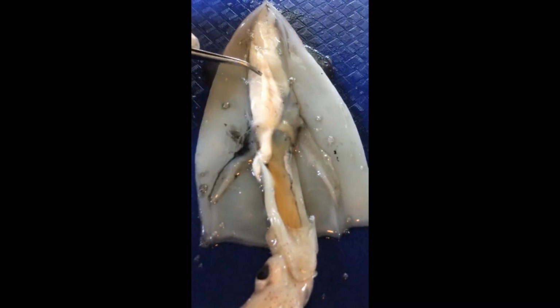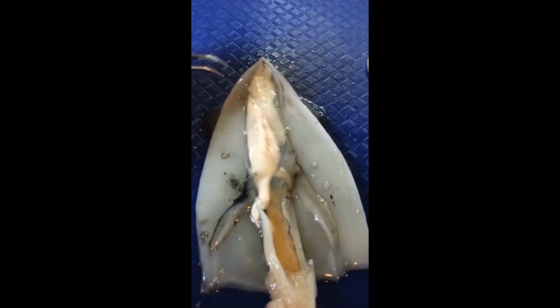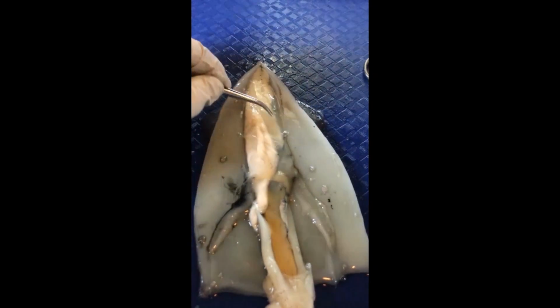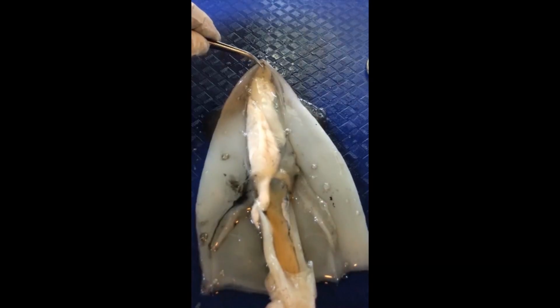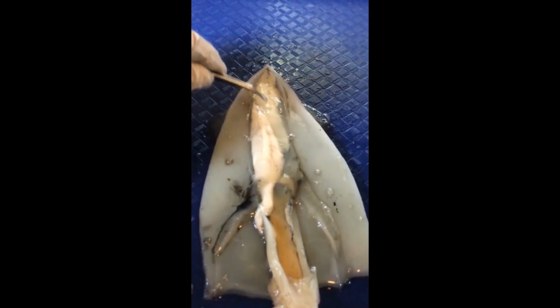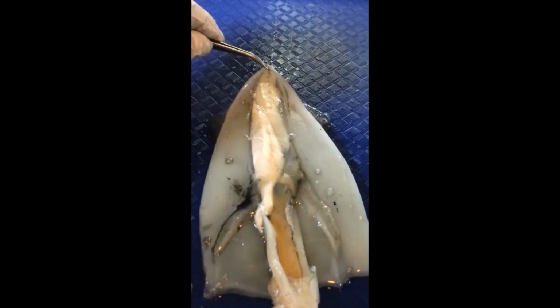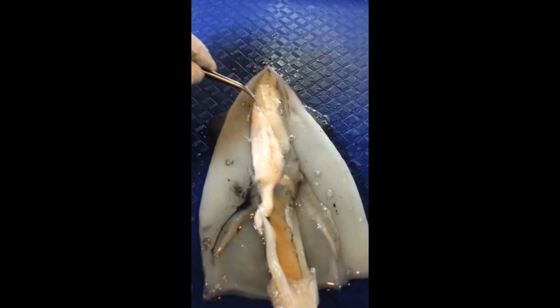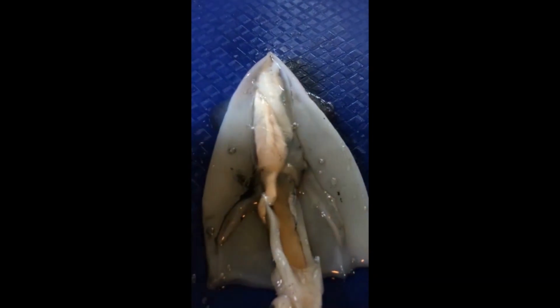This part right here is called the stomach, and it is part of the digestive system of the squid. And then if we take a closer look right here, this lets us know whether it's male or female. Male testes have a more milky color, and females have a yellowish, more gooey color to it. So we can look right here and know that this is actually a male and not a female. On females, you can definitely tell the coloration's much darker, more yellowish, as I just described, and in a lot of them you can actually see the eggs right here at the top, which is really cool. So here we actually have a male.